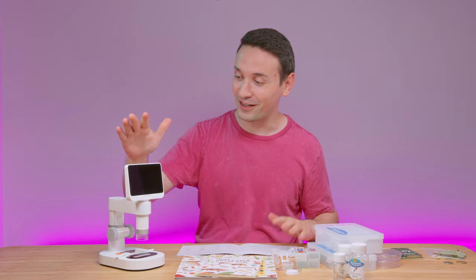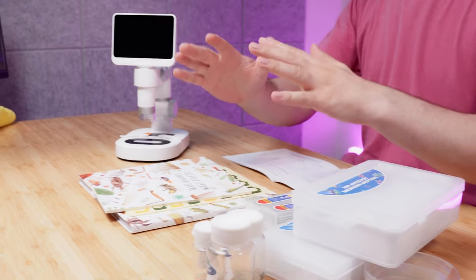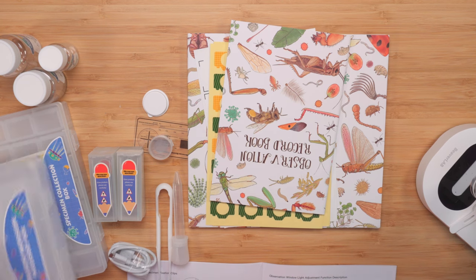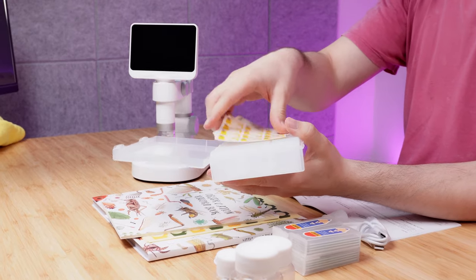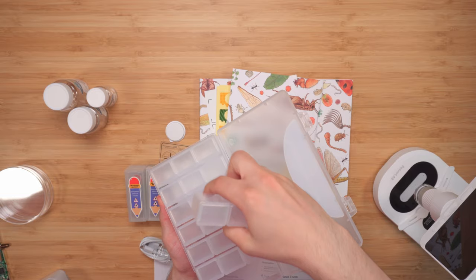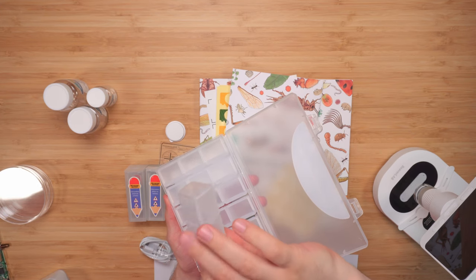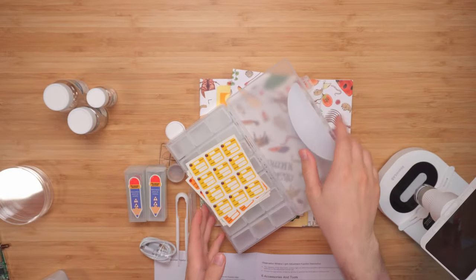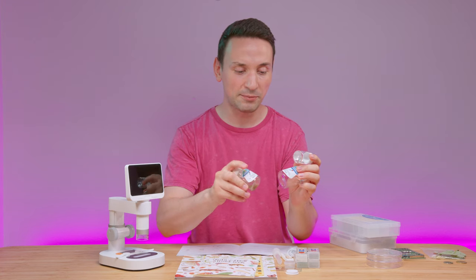Taking a look at what we get here, there are quite a few things. We get the tool storage box and the specimen collection box, which comes with quite some storage — a total of seven storage units, each with three smaller compartments inside. We also get a lot of stickers.